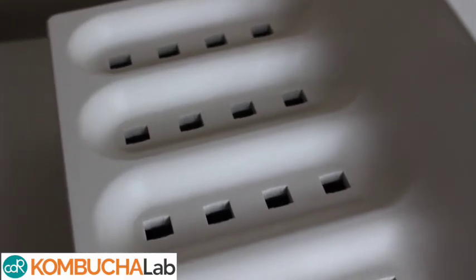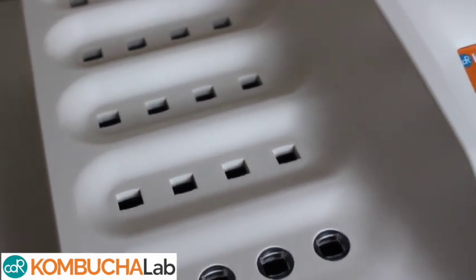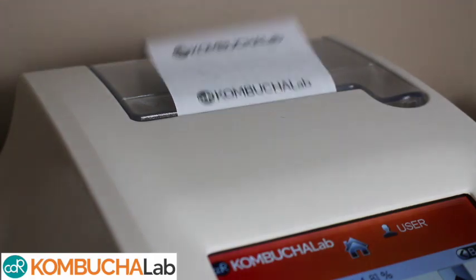The Kombucha Lab Touch is ideal if you will be running multiple samples or tests at once. It has 16 incubation cells which allows you to run up to 16 samples at a time, a multitasking mode to run multiple tests at once, and a built-in thermal printer.